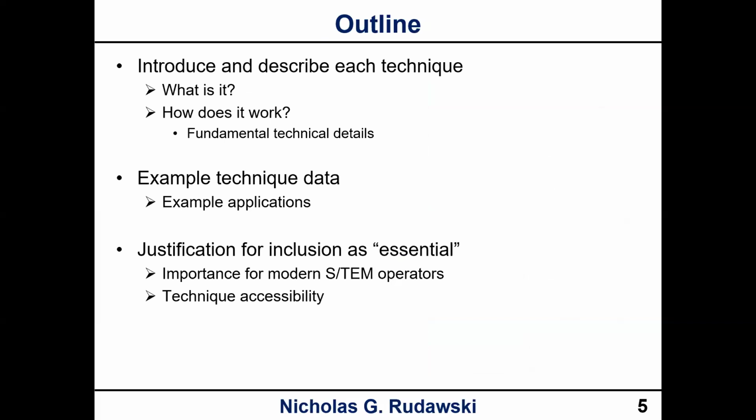So the basic outline: we're going to introduce and describe each technique, what it is and how it works fundamentally and technically. We're going to see lots of data and application examples. And then, of course, we're going to talk about the justification for why it is included as essential.